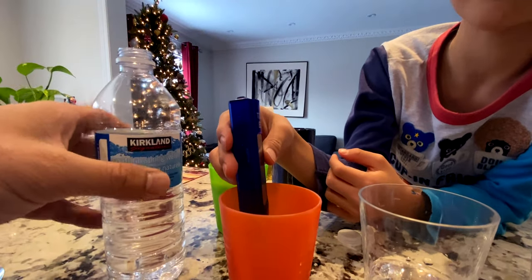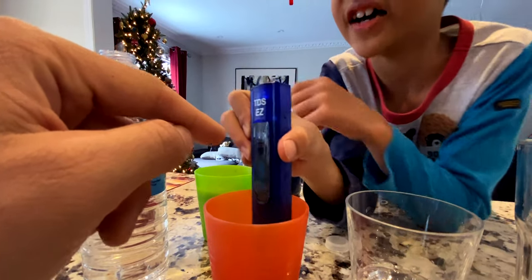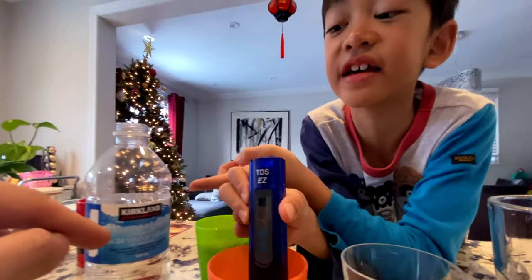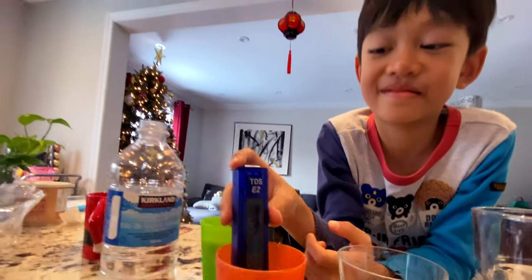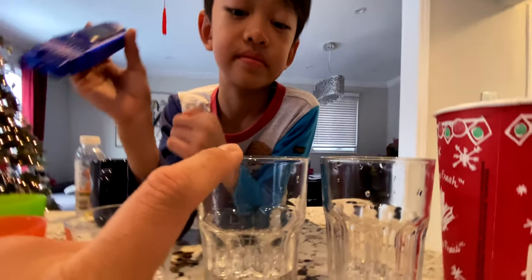This is the water bottle and it's almost contaminated water. So MCDs should never use this. Now skip the osmosis — let's do the cold water tap.